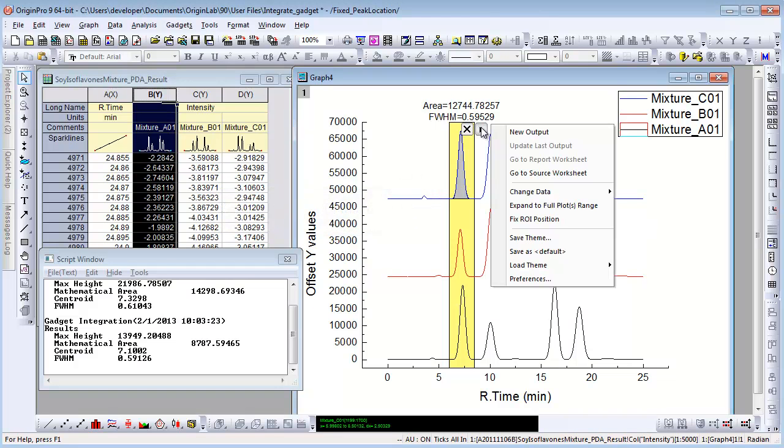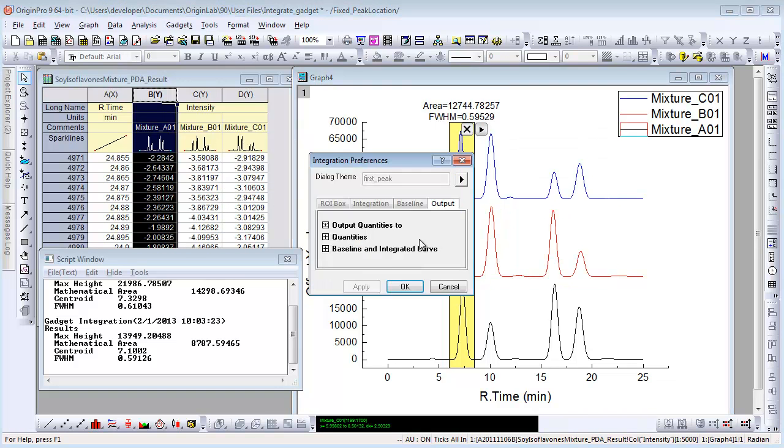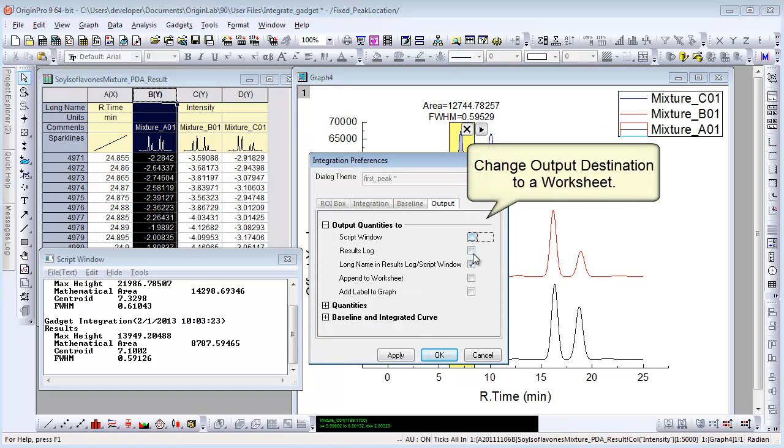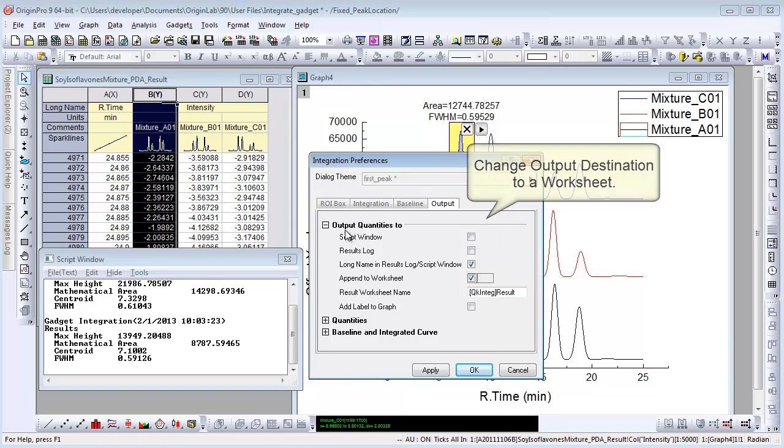We can also change the output destination. Let's choose Preferences again. On Output tab, uncheck Script Window and check Append to Worksheet.